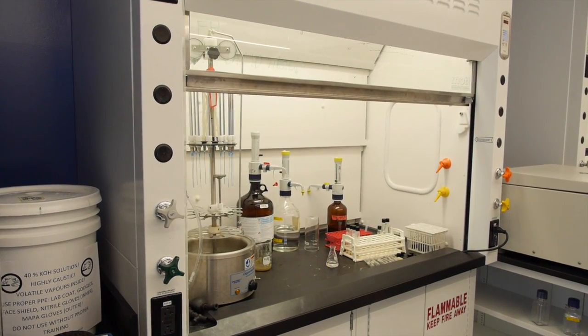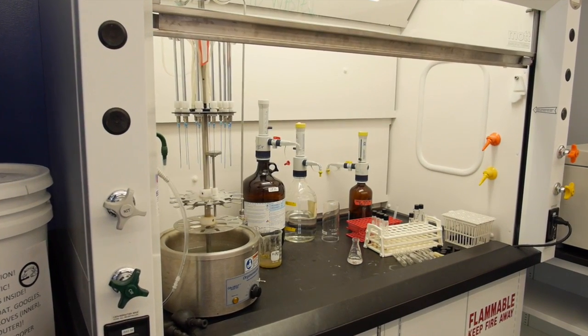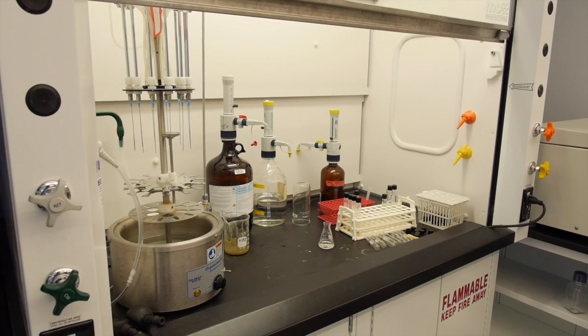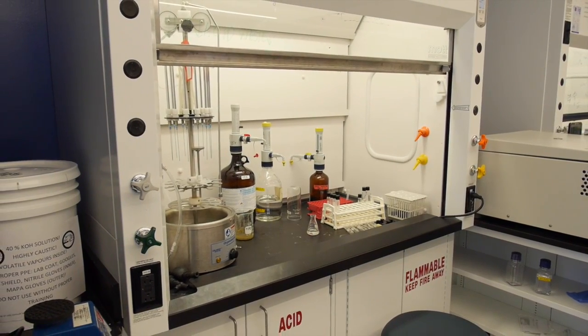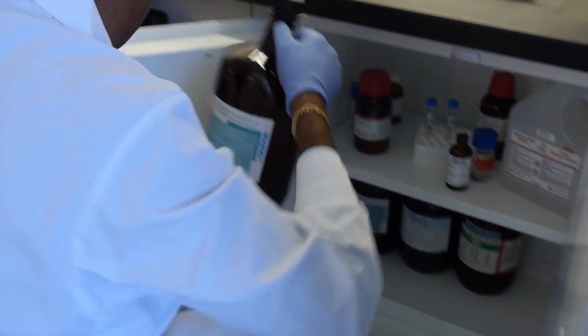It's important not to use the fume hood as a storage area. This creates a hazard by potentially blocking airflow and interfering with the containment of vapors and aerosols. When you have excessive storage of materials or equipment, it can cause turbulence or reverse flow, resulting in vapors and aerosols escaping from the hood.